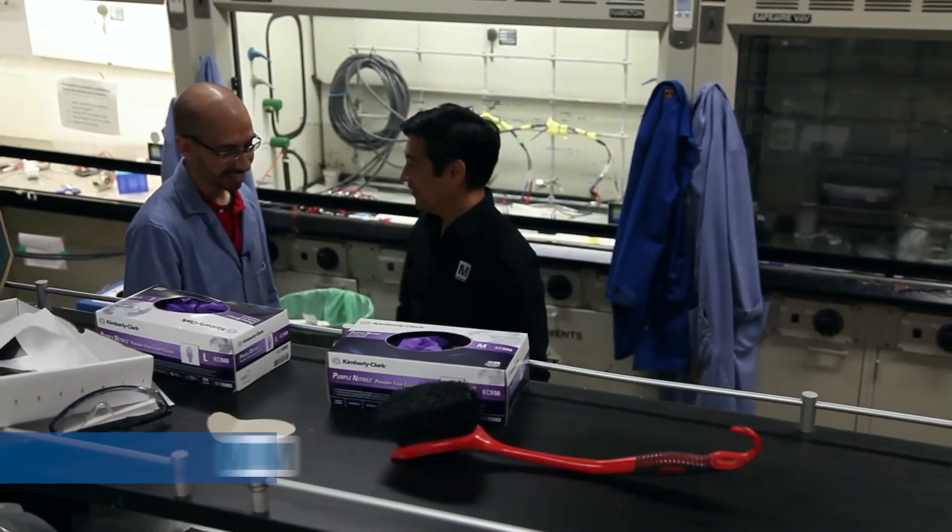Hi, nice to meet you. So you're going to do a demo here of how you make graphene.